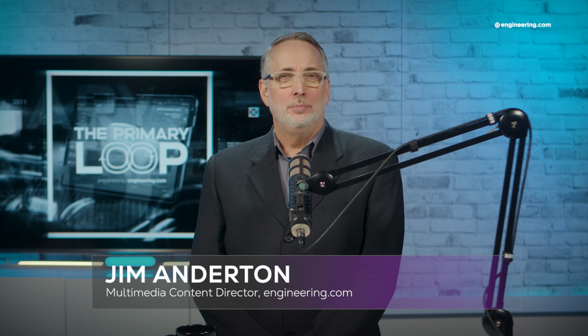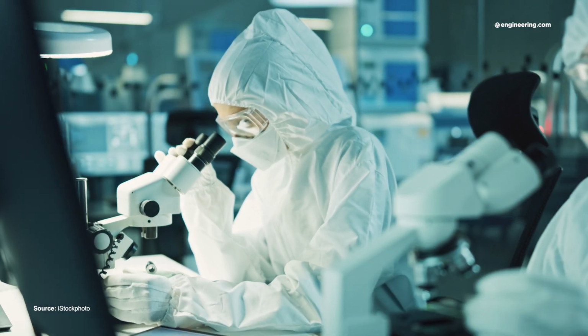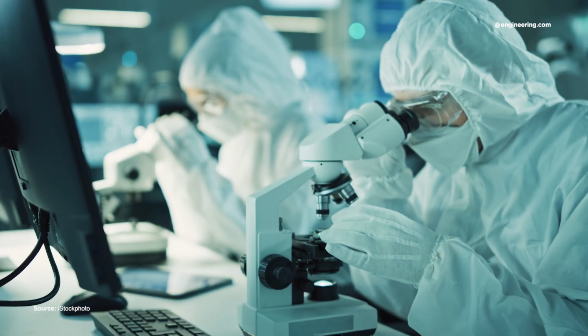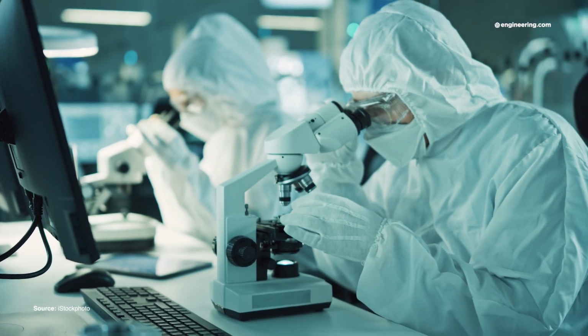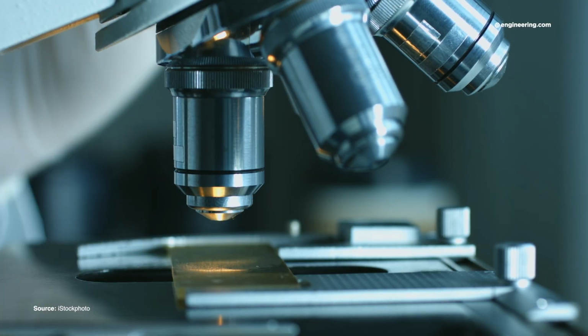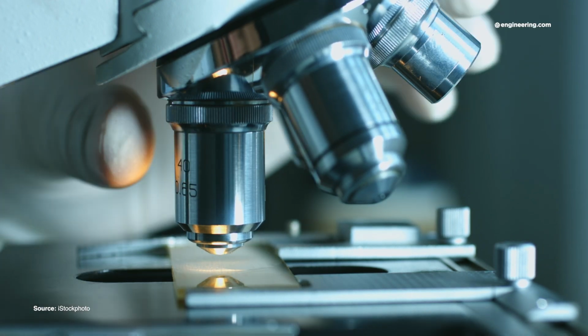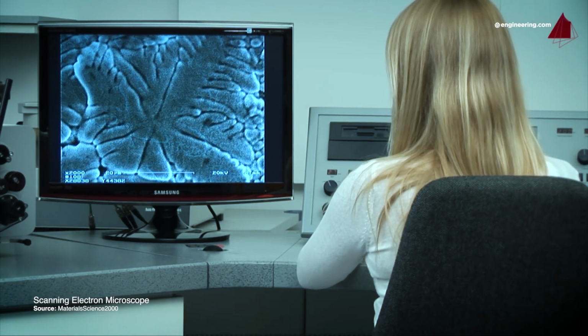I'm Jim Anderton, Multimedia Content Director here at Engineering.com. Microscopy has been the key to understanding everything from the nature of disease to the behavior of metal alloys, and it's used everywhere from medicine to manufacturing quality control. Optical microscopy has resolution limits that are strictly dictated by the physics of light, and even electron microscopy struggles at atomic scales. But there's another form called atomic force microscopy, which can reach down to the atomic level and deliver insights that have broad applications in science and engineering.